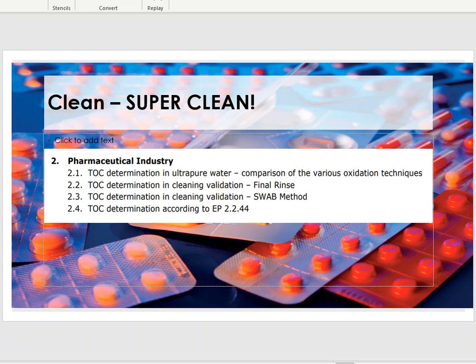All right, so what you're seeing here is that water is used in the pharmaceutical industry. And that water is either used in the manufacturing of that pharmaceutical product, or it's used in the cleaning up of that pharmaceutical product, or it's used in the testing of that pharmaceutical product. And in all realms, that water has to be extremely clean. So I can't make aspirin in dirty filth water and then recover the aspirin and form it into a tablet and give it to you to take, right?